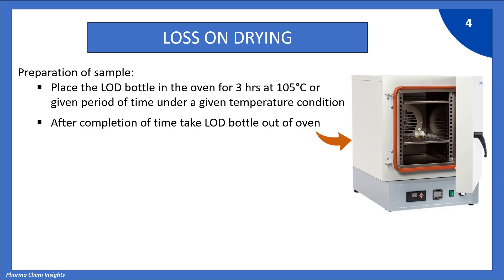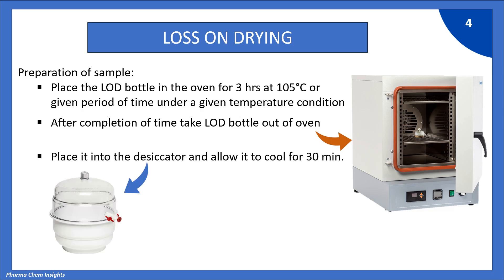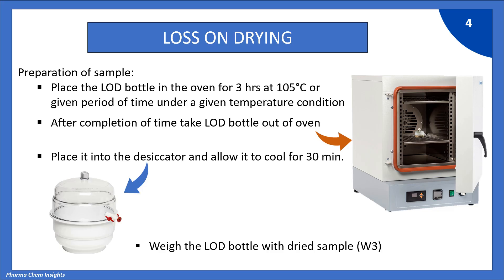After completion of time, take the LOD bottle out of the oven. Place it into the desiccator and allow it to cool for 30 minutes. Weigh the LOD bottle with dried sample as W3 gram. Please note: every time you place the LOD bottle in the desiccator for cooling, cool it for exactly 30 minutes and then weigh, so there will be less chance of error in LOD.